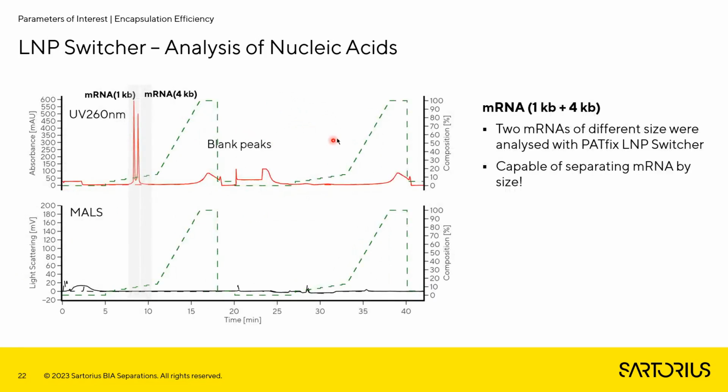Here is another example, where we analyze two different mRNAs with different sizes. The first mRNA was 1 kilobase, and the second one was 4 kilobases long.